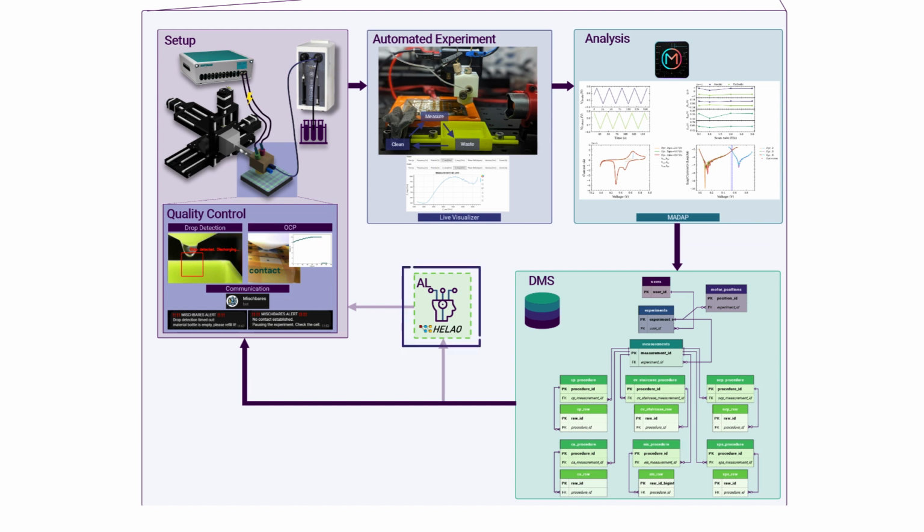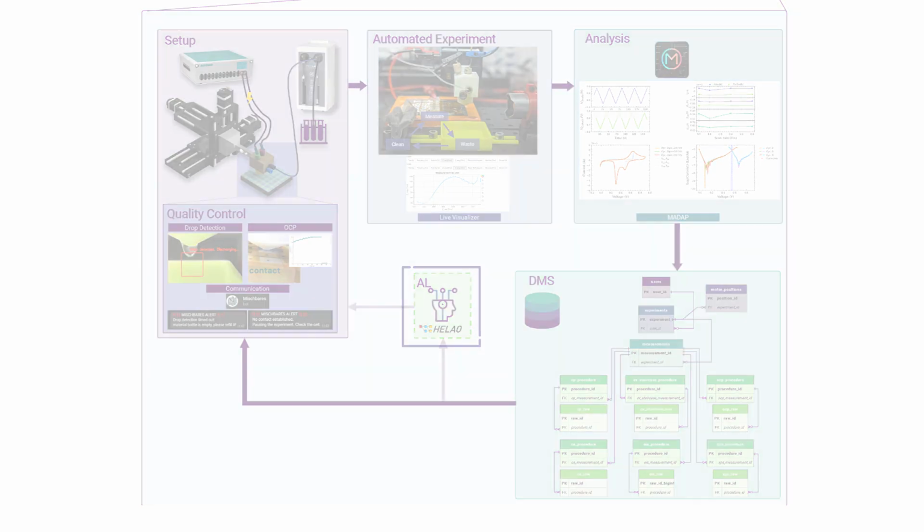As demonstrated in the HELAO platform, it's possible to optimize subsequent experiments using an active learning algorithm. With the addition of our data management system, this process has been further enhanced.